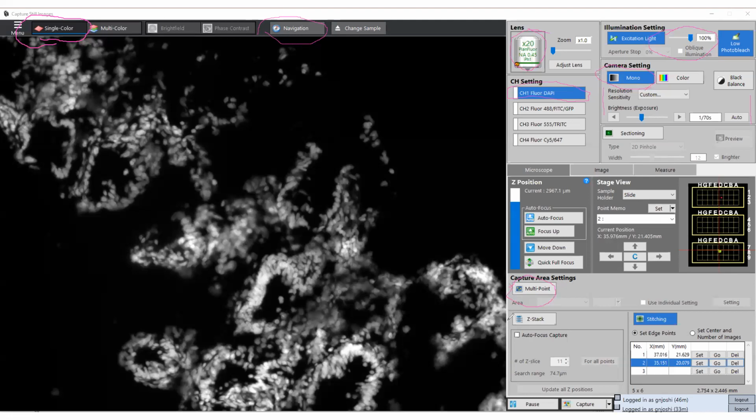Definitely, you will be using the ZStack acquisition, right? So I will show you how to acquire ZStack because your samples have a good amount of depth, and either we will do multi-point for you or stitching. So once you bring your samples in tomorrow, we will figure out what's the best way of imaging your samples, either doing a multi-point or using a stitching mode, and we will figure that out tomorrow. And let me just clear all of this.